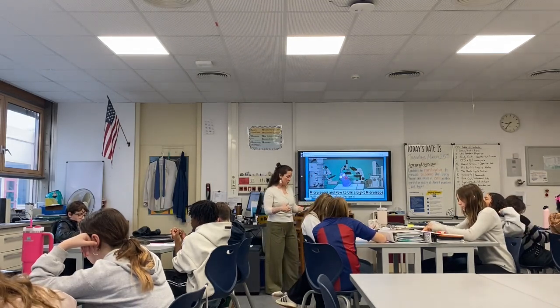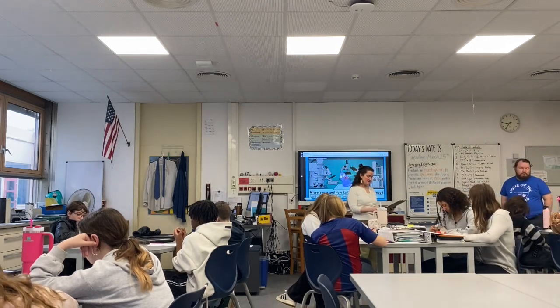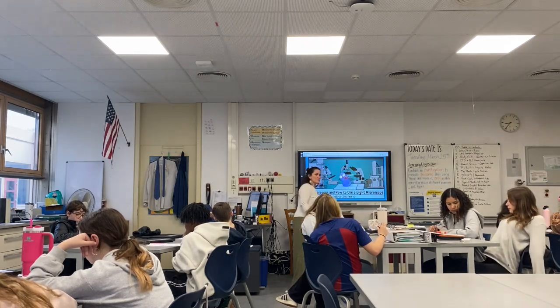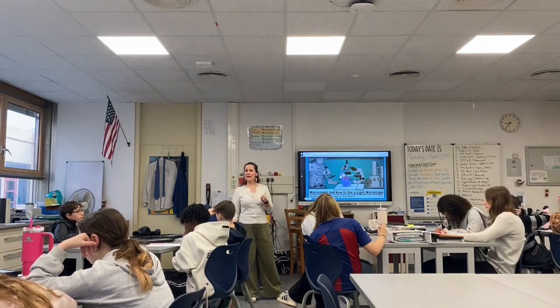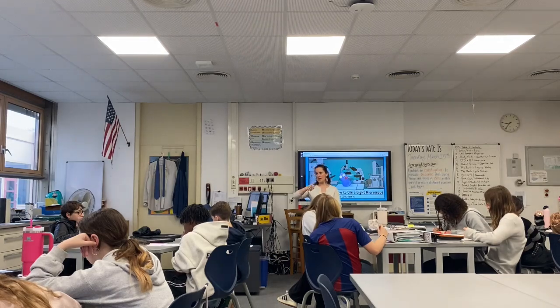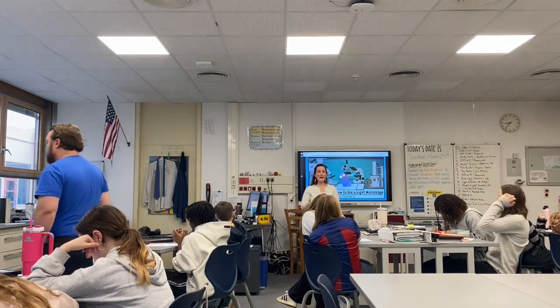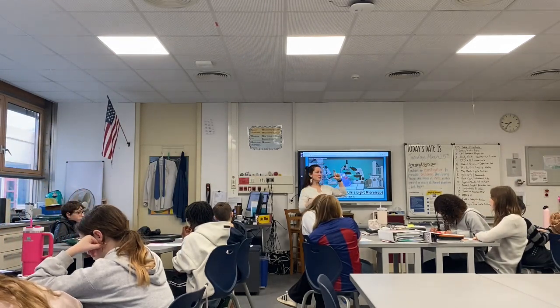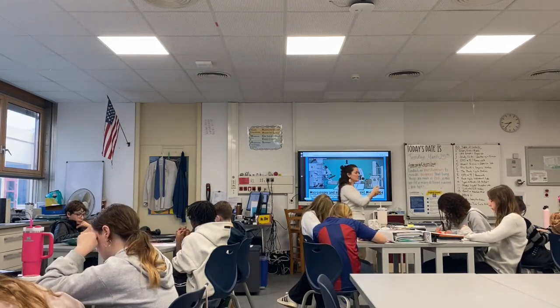And then that goes along too with number 7. It says as you move up to the high power objective lens, avoid using the coarse focus knob. What was the reason for that? It was a safety issue. So it goes back to those slides being glass. The coarse focus knob is going to move the stage up and down a lot. So if I move it up a lot, and then I go to 100 magnification, the lens is longer and it's just going to crush that slide. Okay, so it's for safety reasons too.